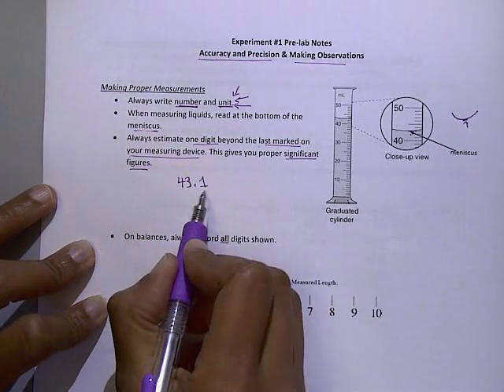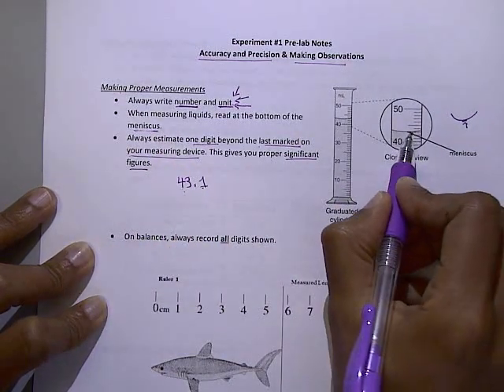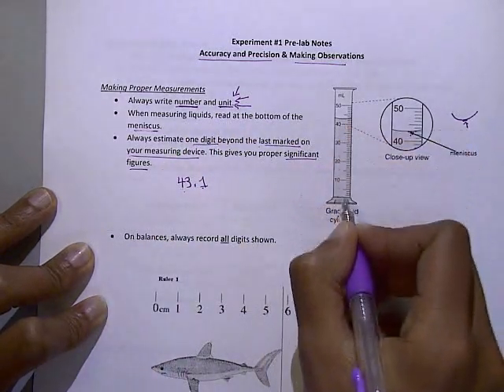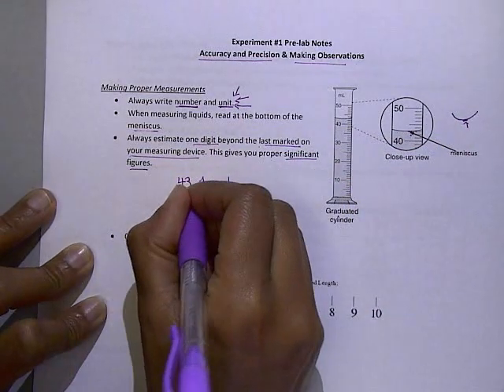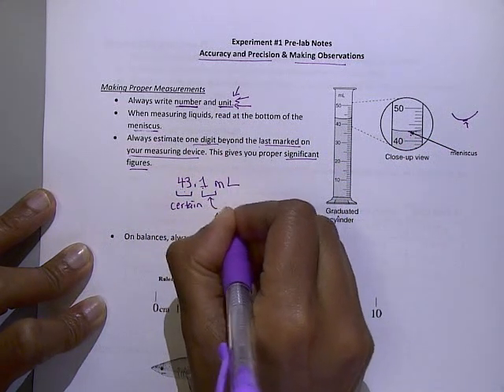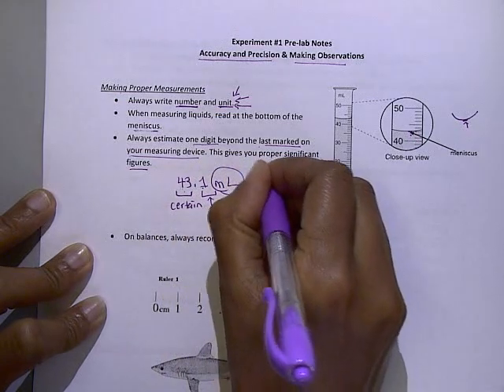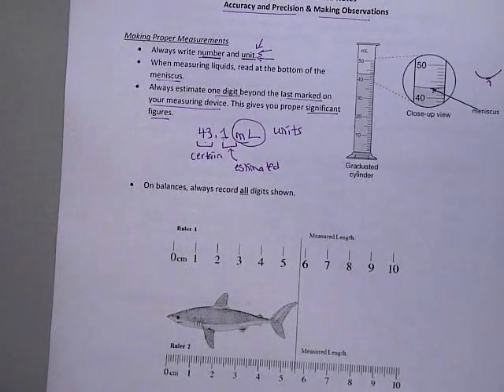So as I mentioned, you want to write down your number and estimate one digit beyond. Here I see this as 43.1, and your units. This is a graduated cylinder. We're measuring liquids, therefore my unit is mL. So 43, I'm certain of 43. The 0.1 is my estimated digit, and milliliters is my units. So this is how you should always record any measurements taken.